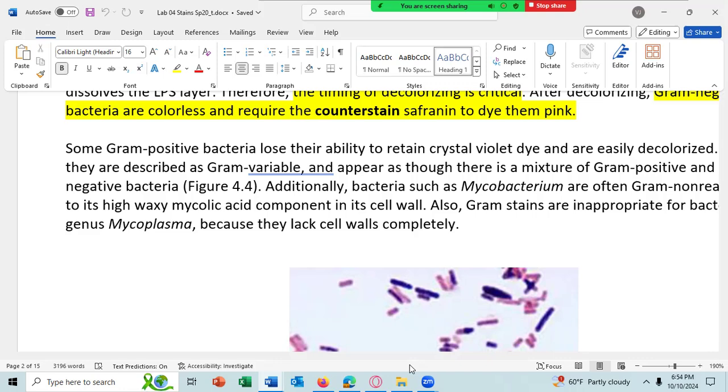All right, I'll tell you, this cell has a very distinct boundary. It's very clear where the cell is and where the cell is not. It's not as clear with that cell where the boundary is, and not as clear as that cell either. In fact, it looks like this cell right there is broken right there.